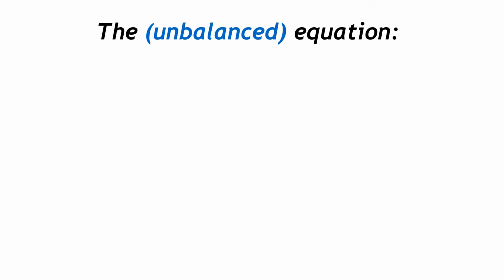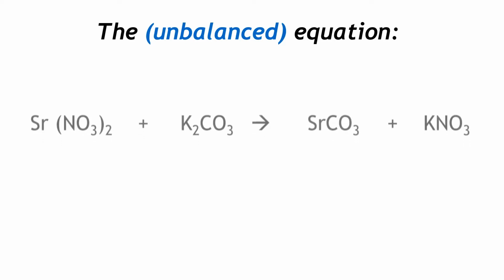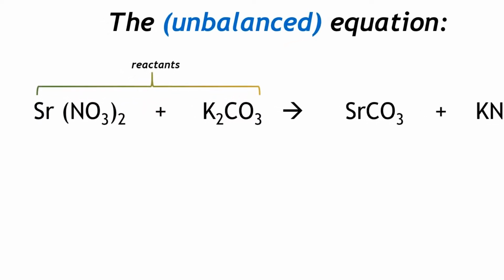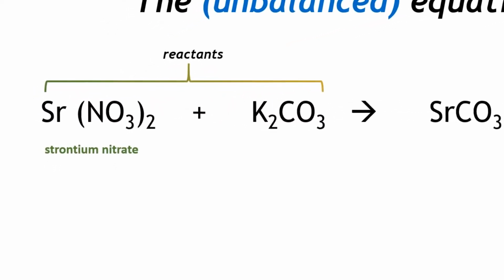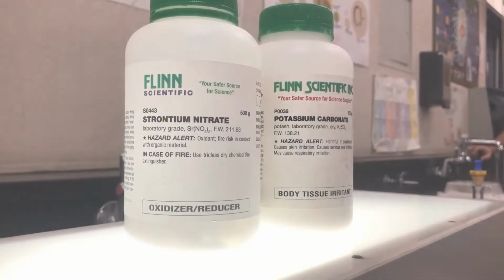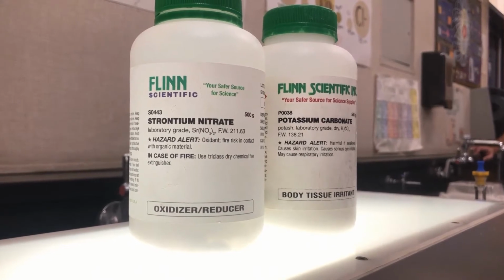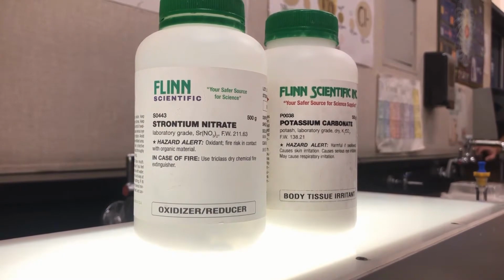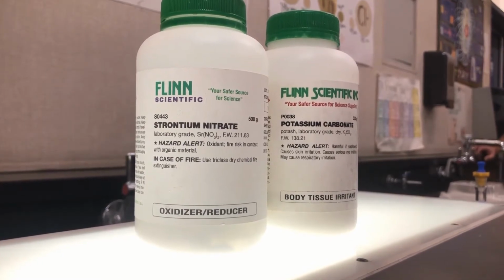In this lab, we are going to attempt to demonstrate conservation of mass in a reaction between strontium nitrate and potassium carbonate. These two substances are laboratory-grade white crystalline solids. We're going to prepare them to a concentration of 0.005 moles.